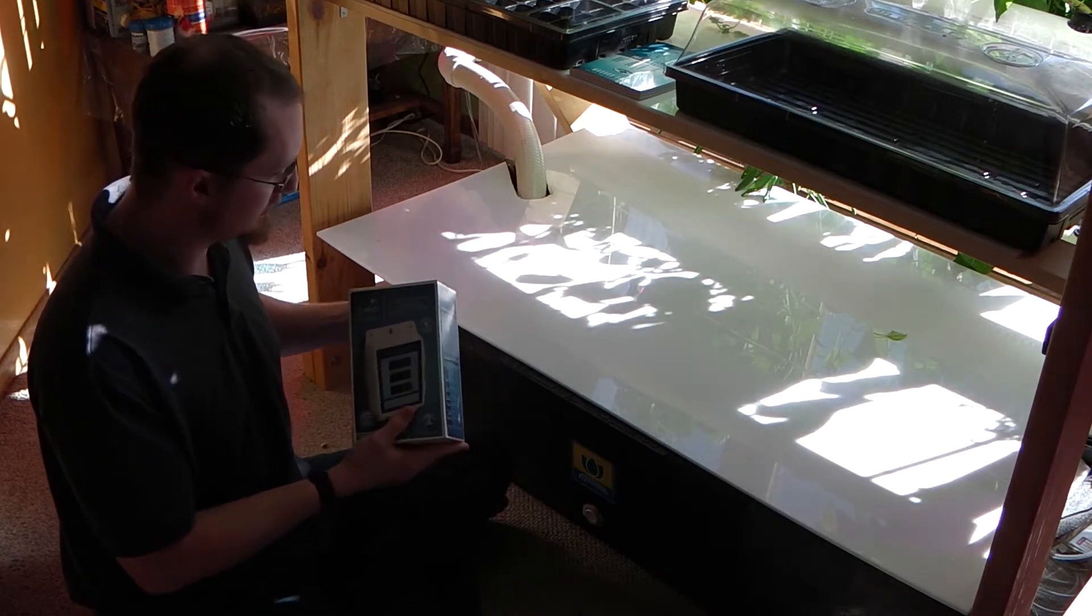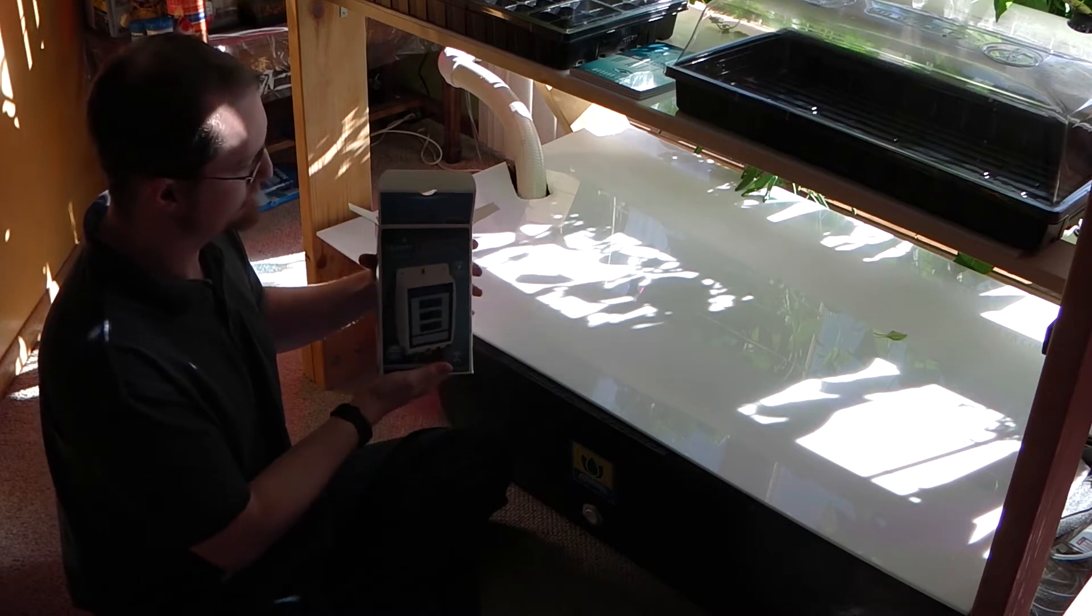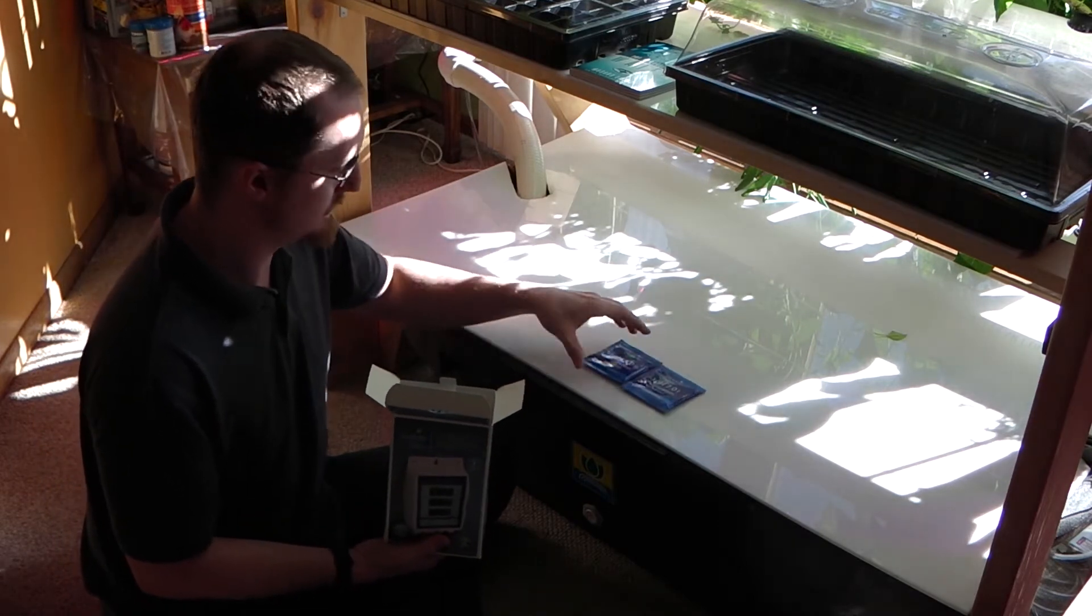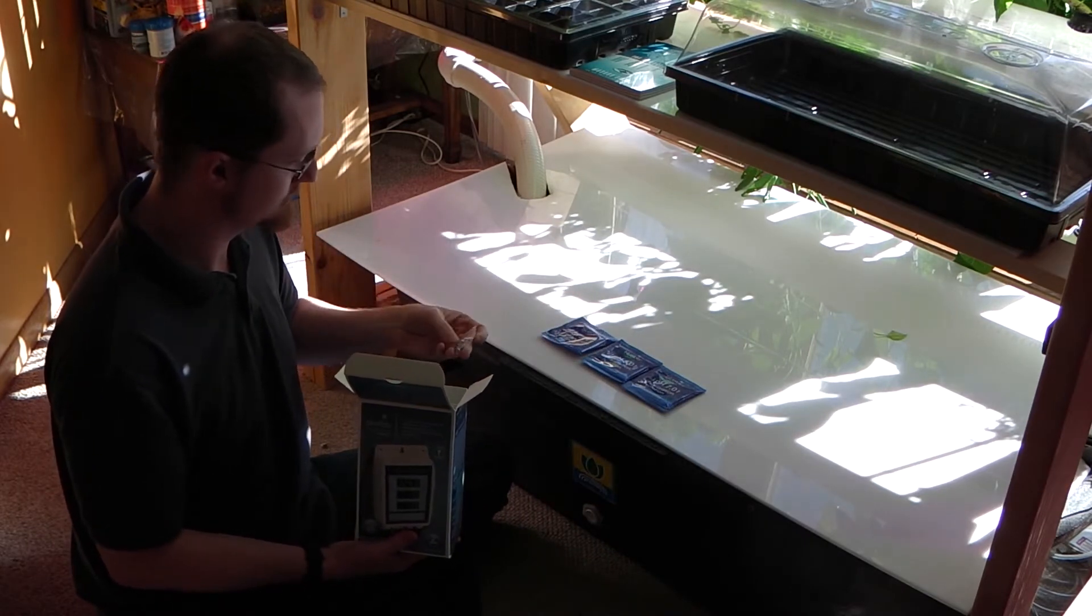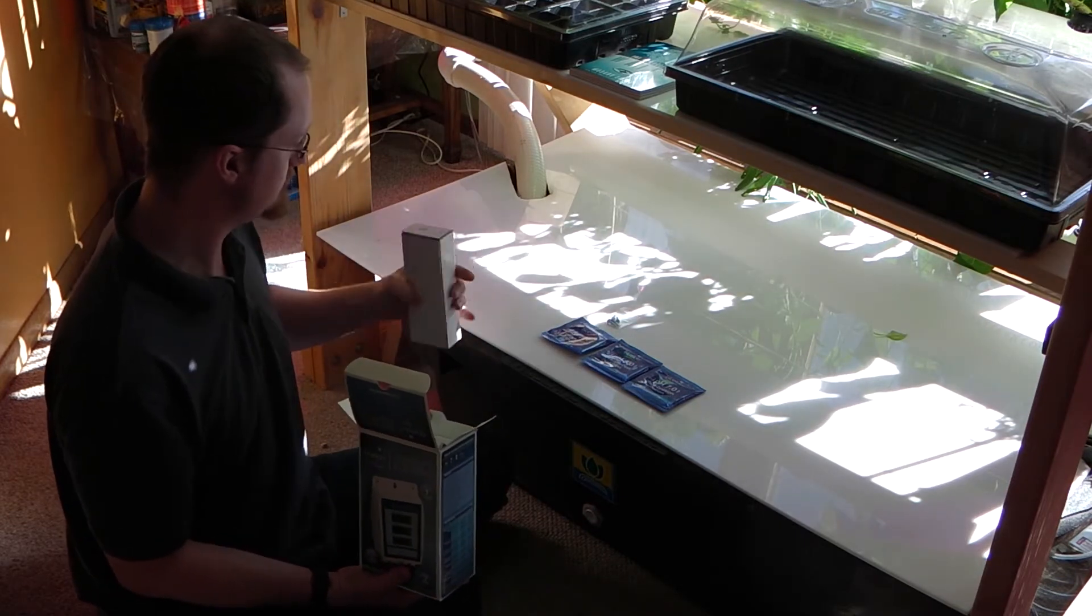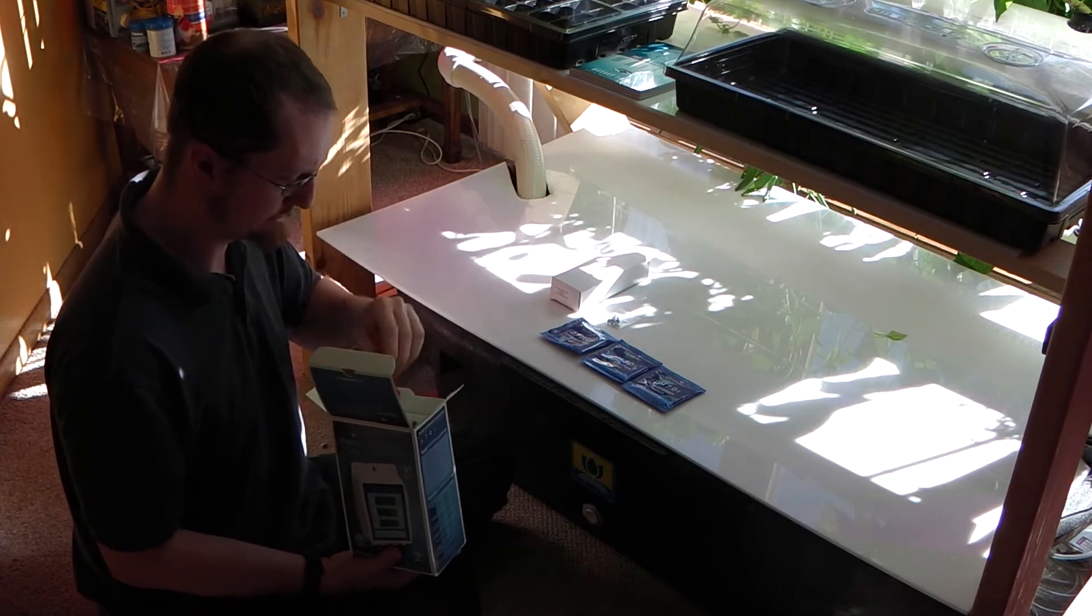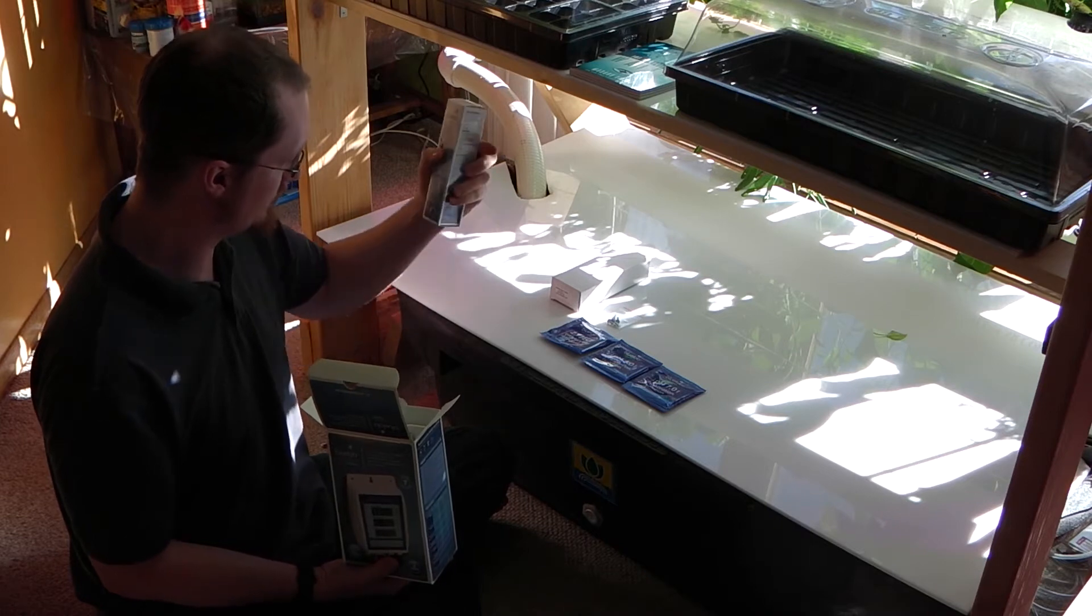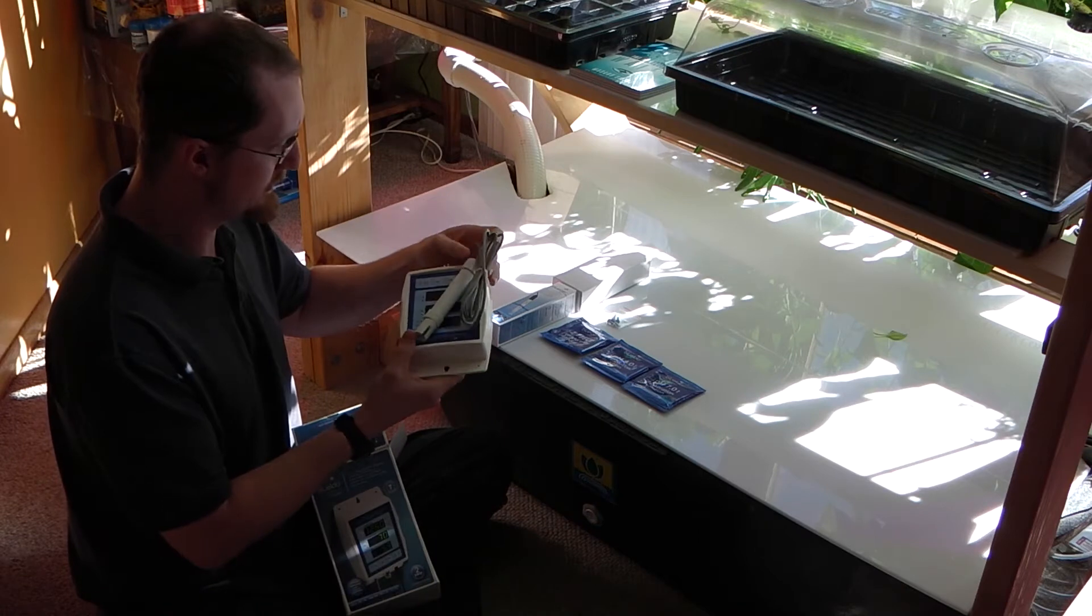Let's open this up and see what she's like. That comes with calibration solution, mounting screws, power supply, the pH probe, and the main unit.